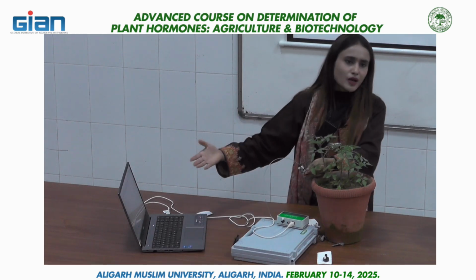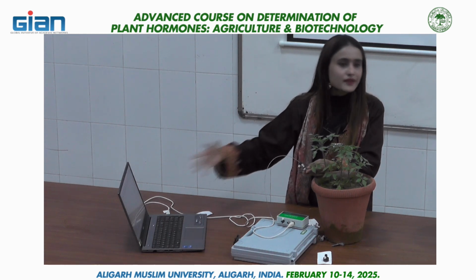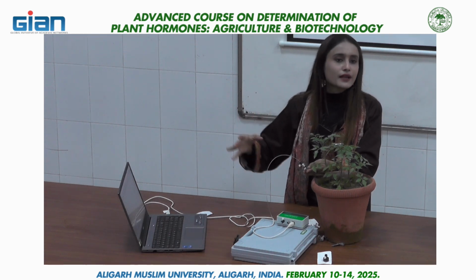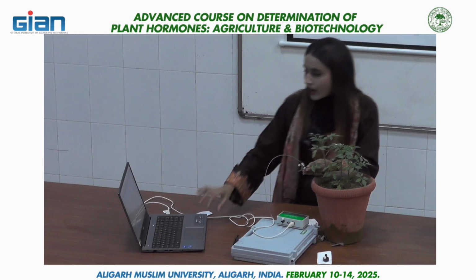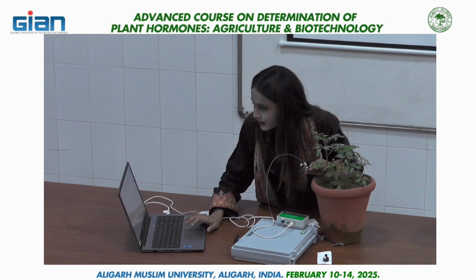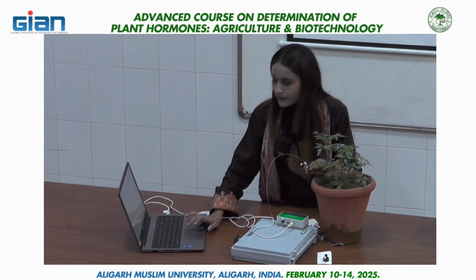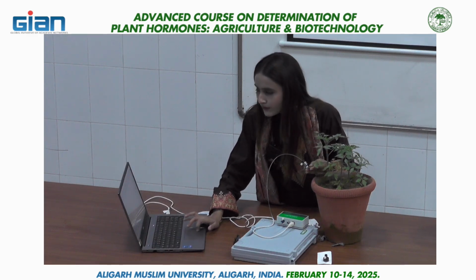So if you want to incorporate these readings in your data, it's totally up to you whatever readings you are going to take. Apart from this, we can also see light curves here. If you want, you can go for it.